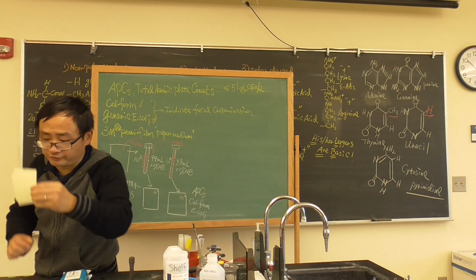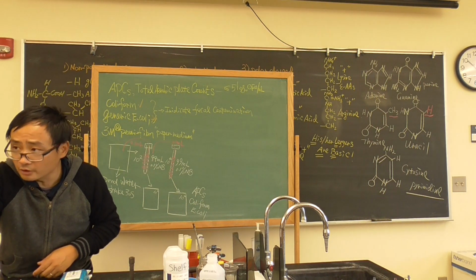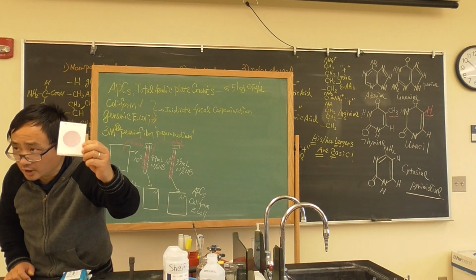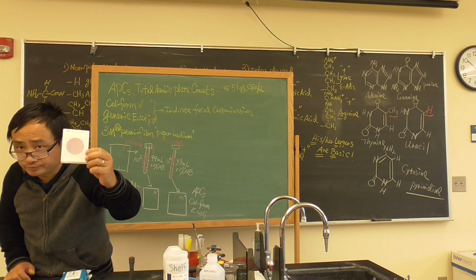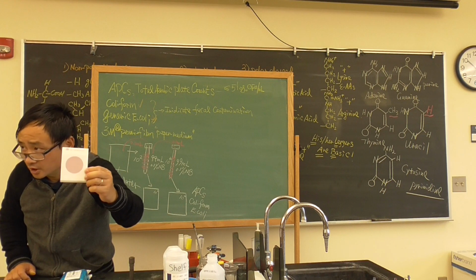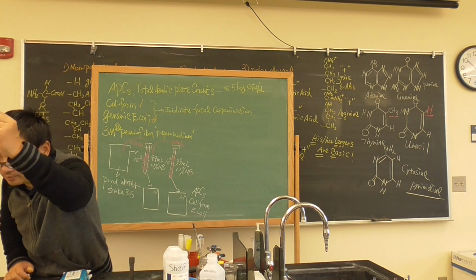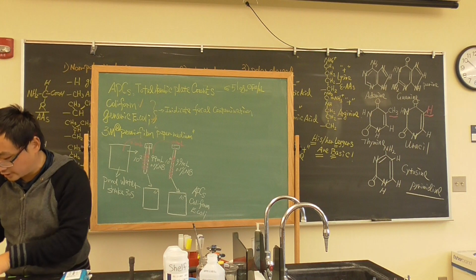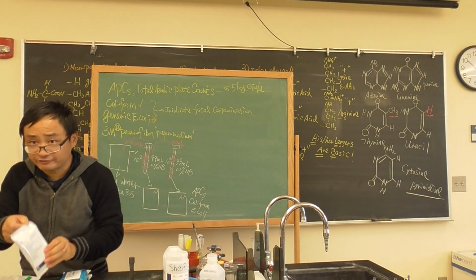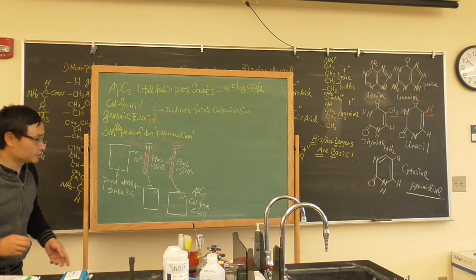10 to the 2, 10 to the 4th. For the coliform, 2 of you got 2 pieces, which means everybody got 1, and you work with your bench partner. You do 10 to the 2nd, your bench partner does 10 to the 4th. If you're by yourself, you can do all of them, okay? Because this is much more expensive. If you look at that, this bag is only 25, and this bag is 50. I don't have them much, so a little bit of difference, okay?